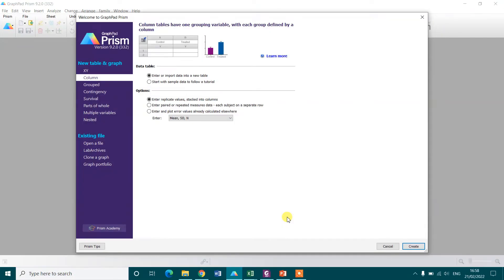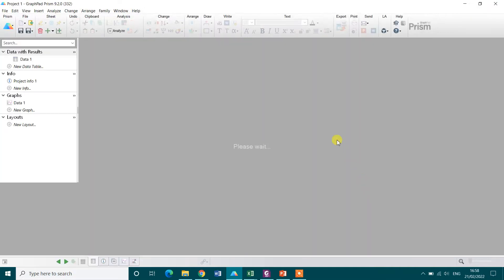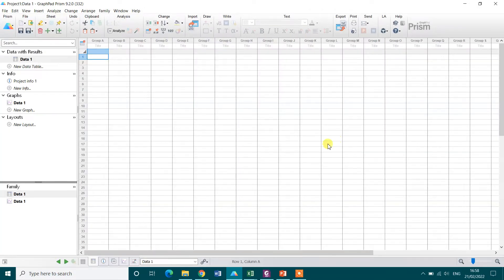Now to perform the one sample t-test, just click on this column option and then click on create. A new datasheet will be open.